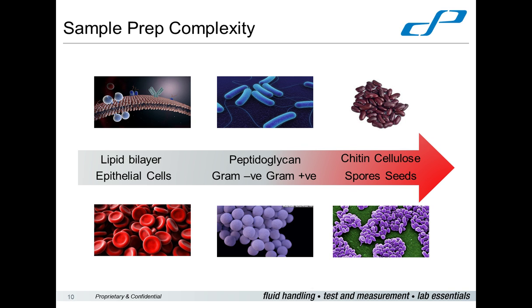So for bacteria, you need a slightly more complex approach. Traditionally, chemical methods may be still effective. Surfactants like SDS can easily break open E. coli, for example. But the thicker the peptidoglycan layer, the more complex the sample process becomes.